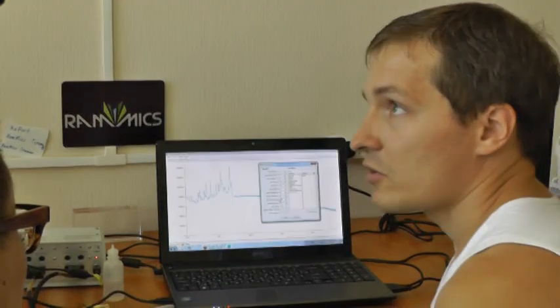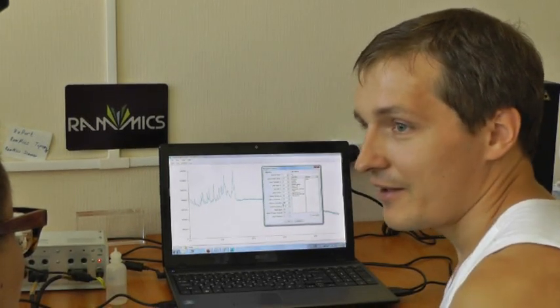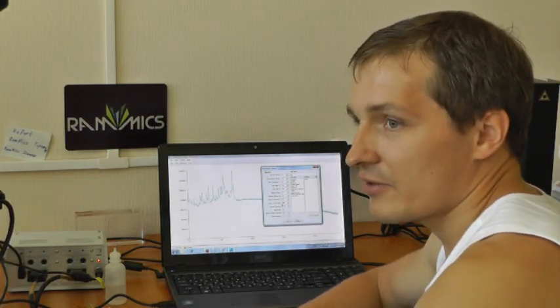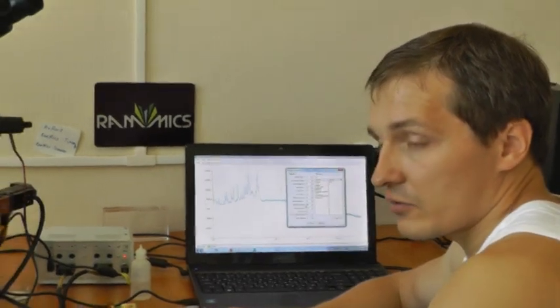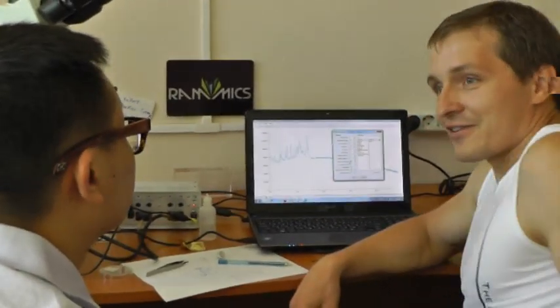Or even the situation with some synthetic narcotics, which are produced every day with modifications, with extra chemical groups, which may not be present in our database because they are freshly constructed.